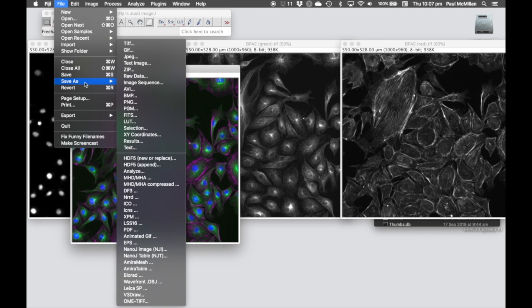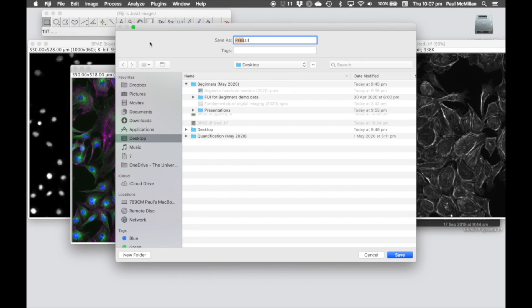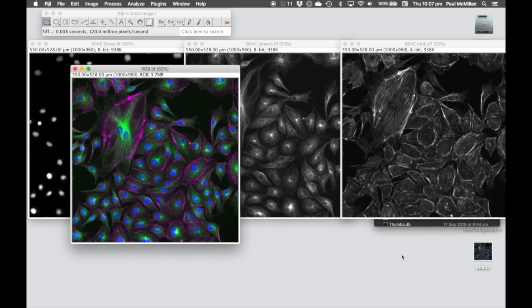We can just go Save As TIFF, and rename to whatever you want, and save that onto the desktop.